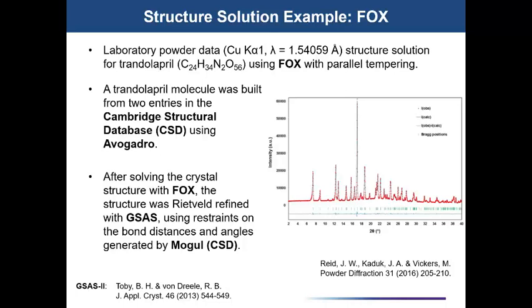And then the reciprocal space methods would be faster. They can be. You saw that one example that was quite a lot faster. It can be slower as well, but it's typically going to be faster with reciprocal space methods.